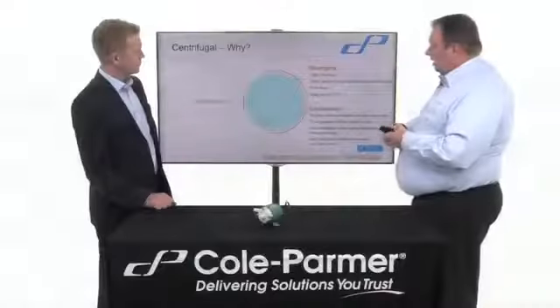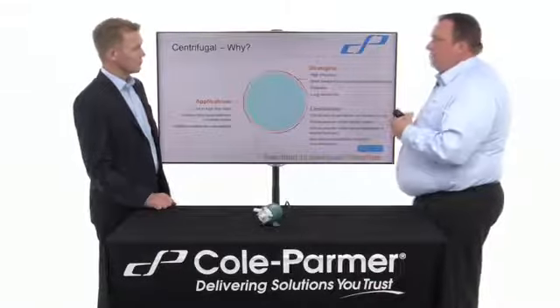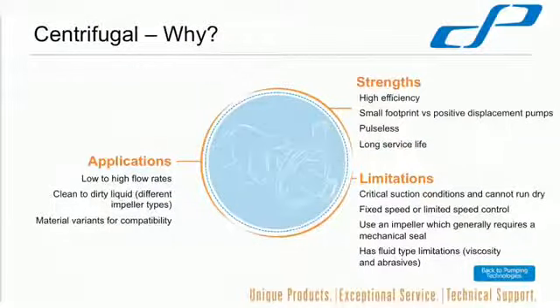Summarise what I've been saying. High efficiency was something I've defined. Smaller footprint. We mean by smaller footprint, not so much the lab scale side, but when you go to the larger side and the larger scale, when you look at pumps doing bigger flow rates, they have a bigger footprint or ground area that they need to cover.